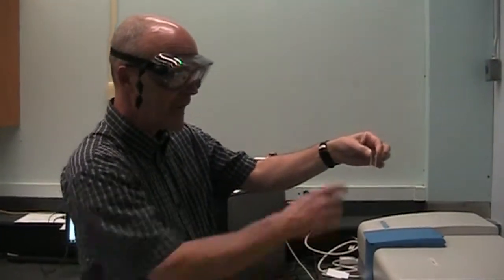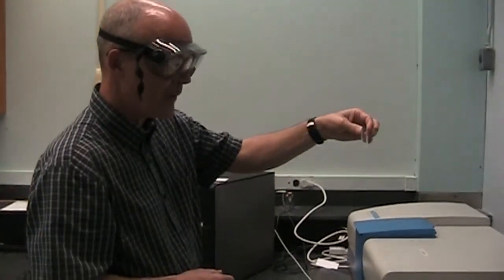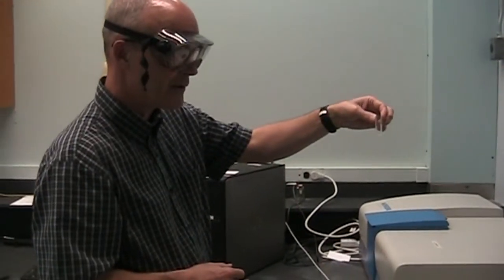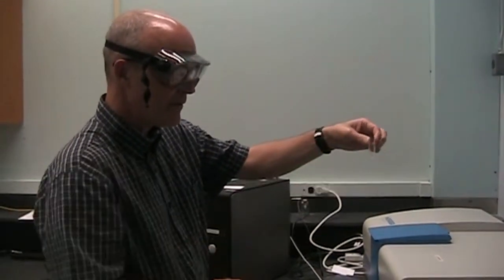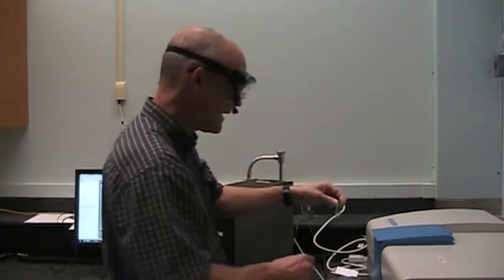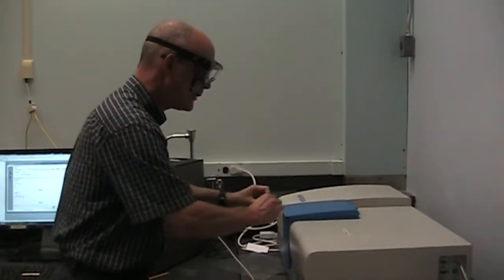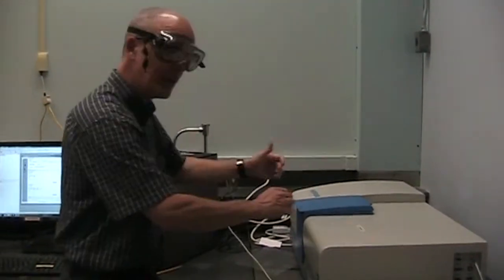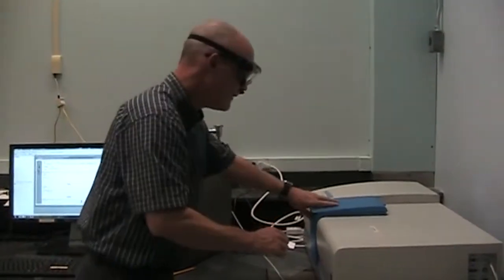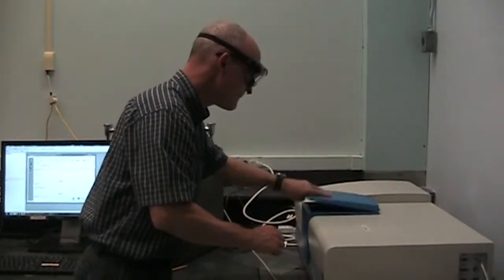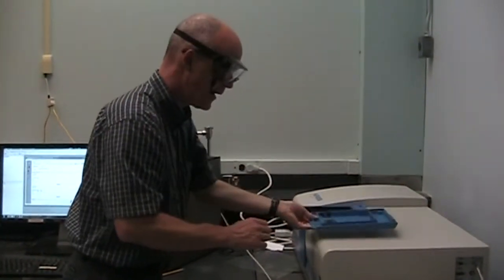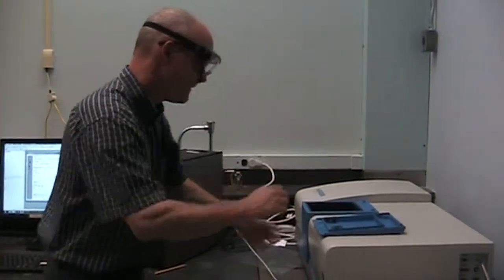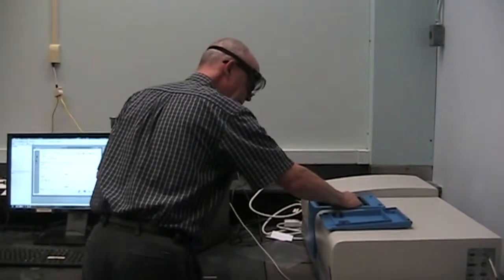So with that you would put an appropriate amount of sample—halfway to two thirds full is fine. Wipe it if necessary, and then it goes into the holder. This is a single beam instrument, only one cuvette can go in. The lid sort of comes off, goes into the cuvette holder.